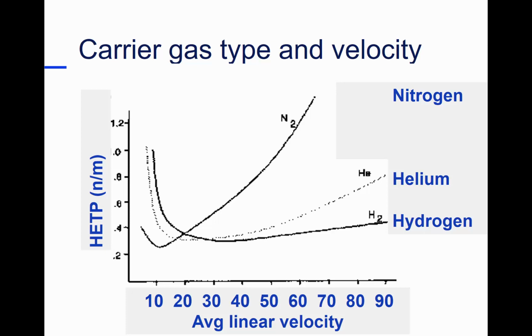So it's interesting to me that in the industry, in most cases, people use helium. They use helium because, what happens to hydrogen if you light it? It will match. If you're lucky, it does. It lights, explodes. But you have to be lucky, which, well, I suppose you'd call it unlucky if it blew up. But from my standpoint, it's really hard to ignite hydrogen. There's only a small concentration balance between oxygen, air, and hydrogen at which you can light it. Most other concentrations, they won't ignite. And so there's very, very little risk.